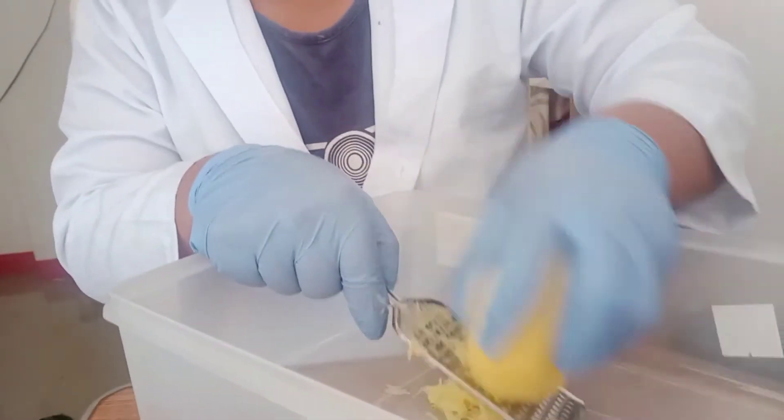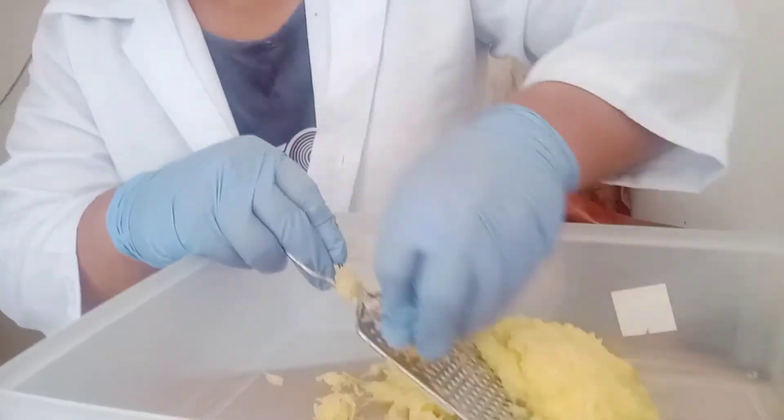Next, we are going to slice the potato into small pieces using the cheese grater. After chopping the potato into small pieces, we will now add some water into the container in order to separate the potato and the starch present in the potato itself.